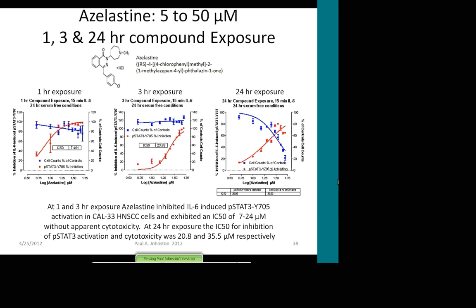So we took each of those compounds in and we did full concentration response curves, and we did a number of time points of exposure. We did 1-hour compound exposure, 3-hour compound exposure, and 24-hour compound exposure. And I'm just showing you the relative data here. I'm plotting the percent inhibition of IL-6-induced STAT3 activation on the left-hand y-axis and cell number on the right-hand y-axis of each of these graphs.